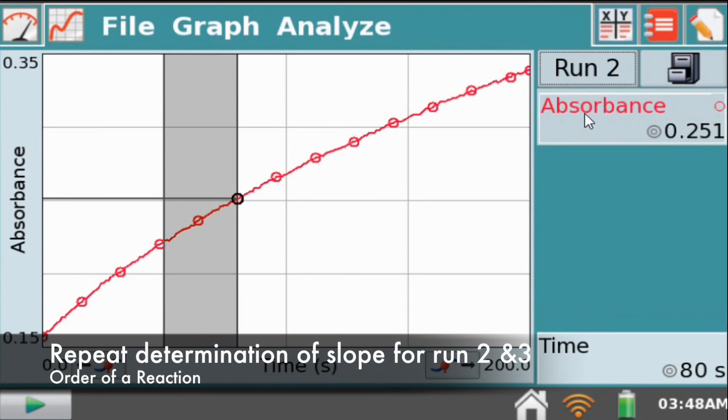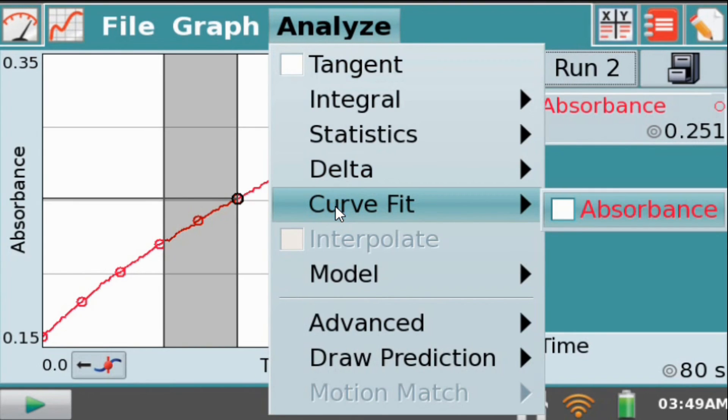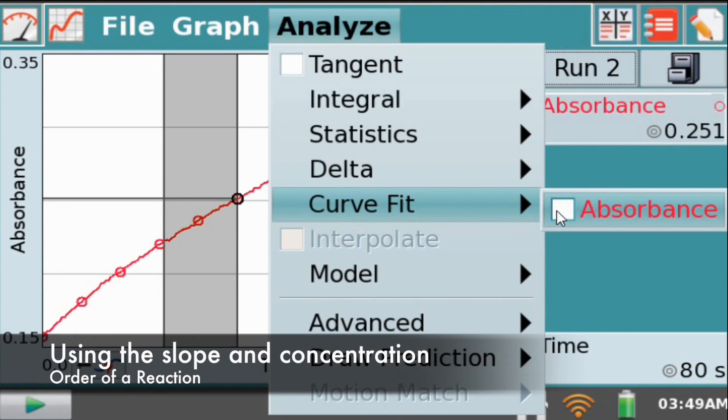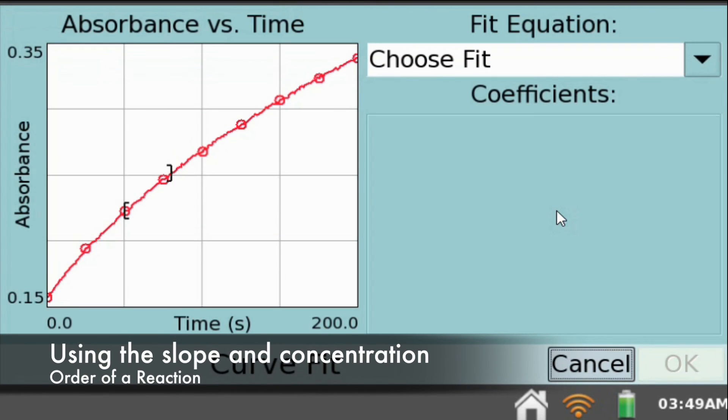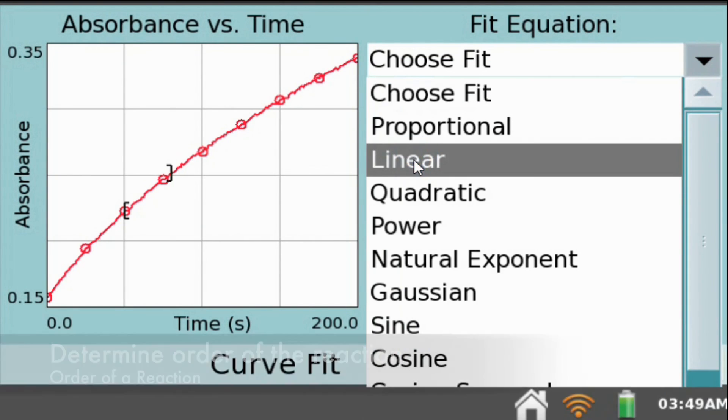Make sure you record the value of the slope m in your data table for all the three runs on your data sheet. Using the data collected, you can determine the order of the reaction just as you would in the initial rate method problems.